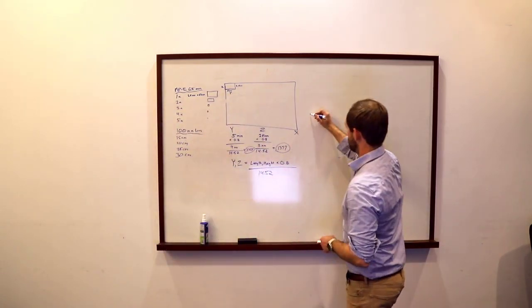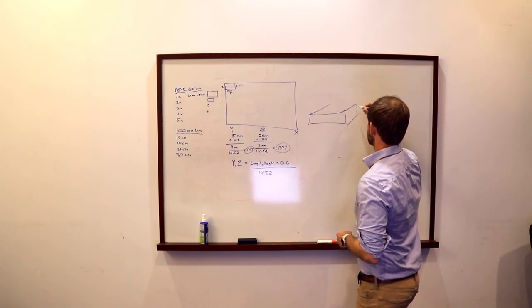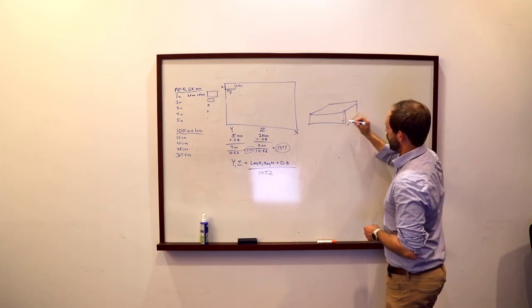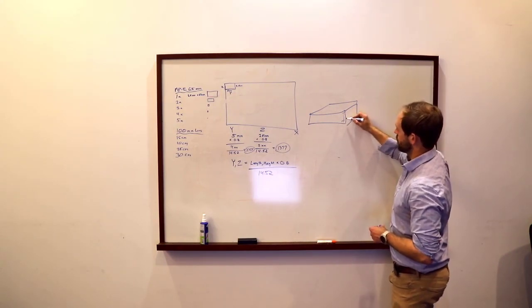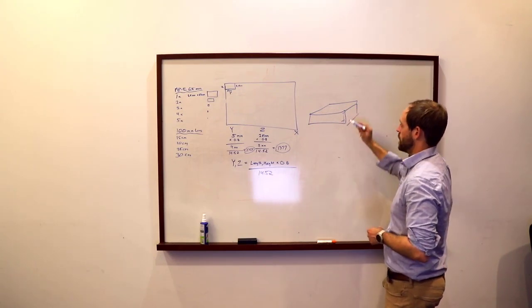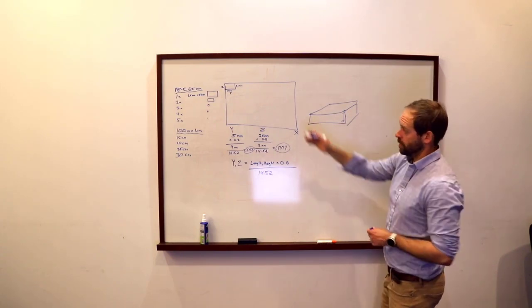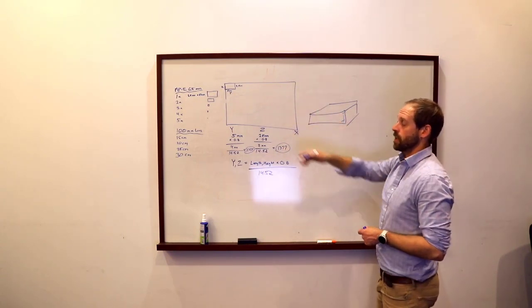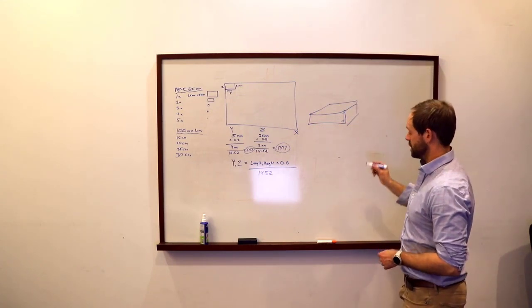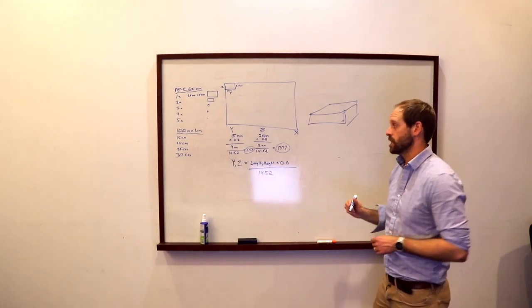So let's think three-dimensionally here. There's our box, and we basically need the height of the box in order to photograph the material in it. If you're just looking at the surface material, you don't need the full height of the box, but you do need to know this. Now that height, depending on your magnification, is going to change, and depending on your distance away from the sample is going to change. But that height is basically corresponding to your aperture. Your aperture is going to drive this.